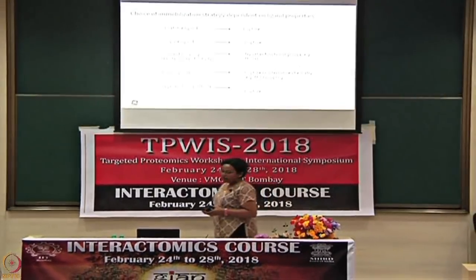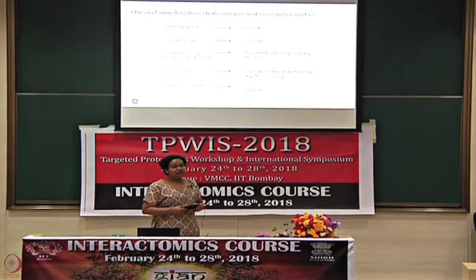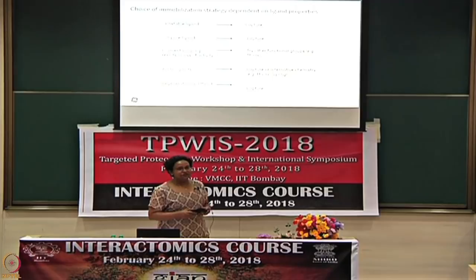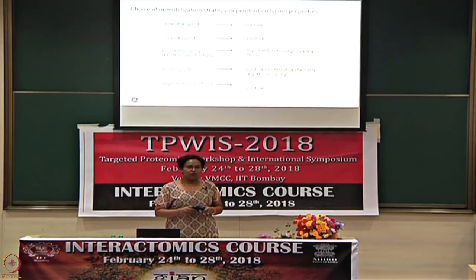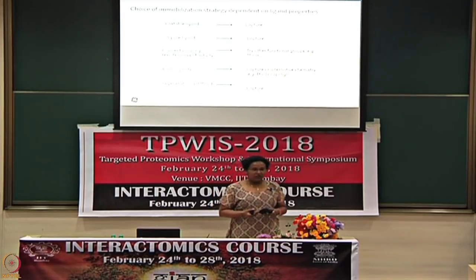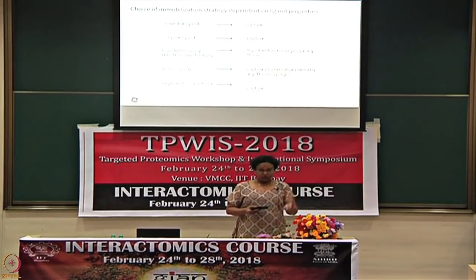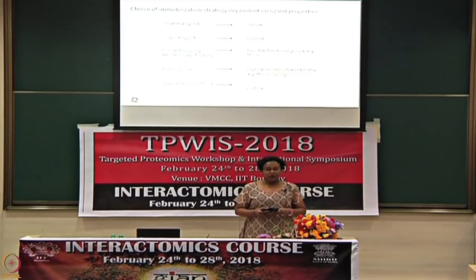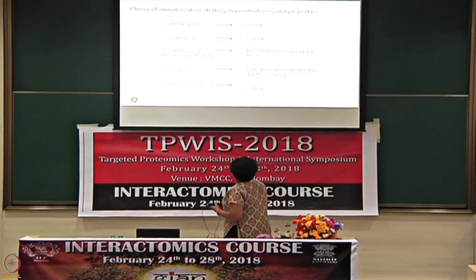Okay. The choice of immobilization strategy will depend on your ligand. Again, amine coupling is very widely used. In more than 90% of the cases we typically use amine coupling, particularly for proteins, because there is a huge amount of amine groups available in most proteins.